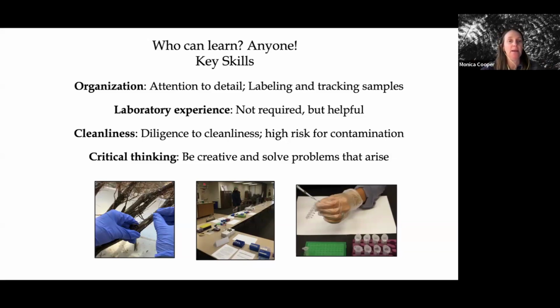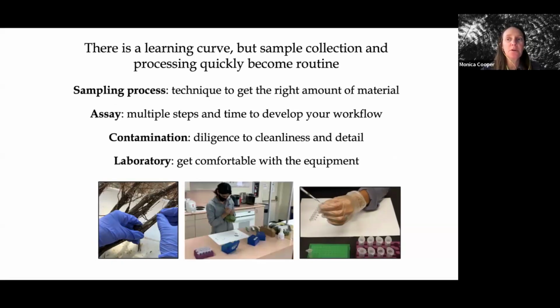We've also found that sometimes things do go wrong, and so you need to be able to think on your feet a bit and solve any problems that arise. There is a learning curve, and we've taught a lot of people how to use the LAMP assay over the years, but sample collection and processing quickly become routine. Once you've done this 100 times, maybe 1,000 times, you get quite good at it.